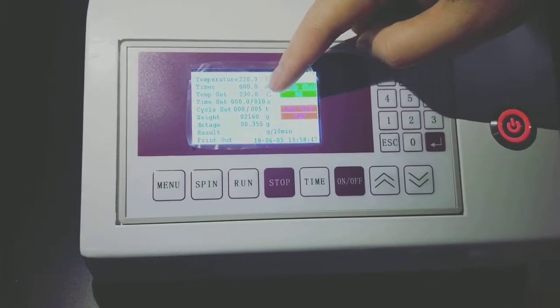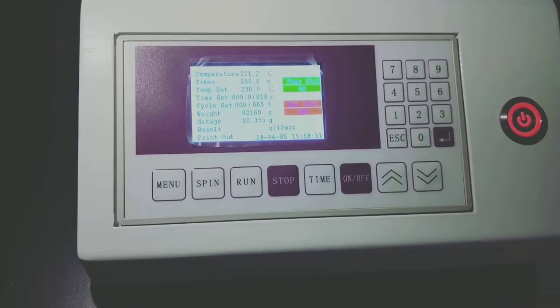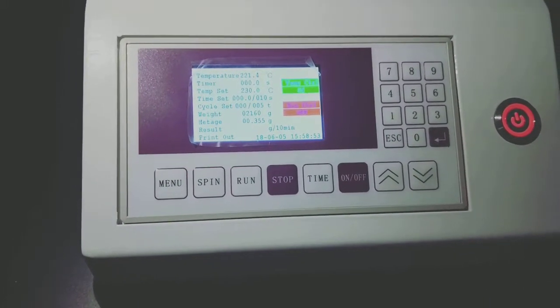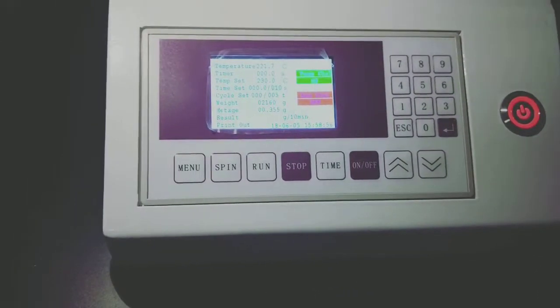And this time set is used for automatically cutting every 10 seconds. If the Melt Flow Index value is small, we can set this time a little bigger, like 20 seconds or others.